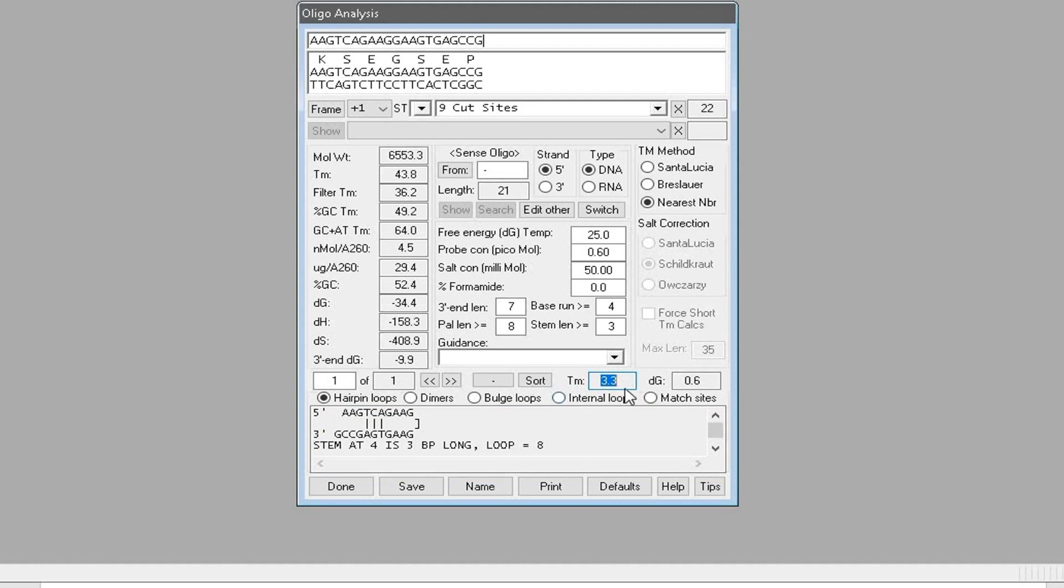It is very unlikely that this temperature will be achieved during the thermal cycle. Therefore, this hairpin loop formation can be ignored.